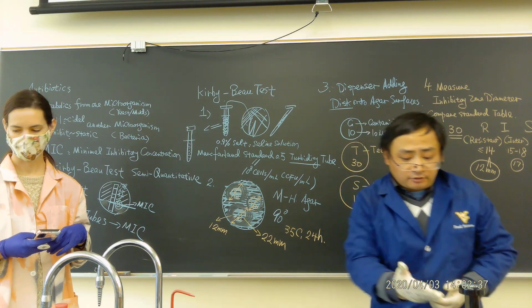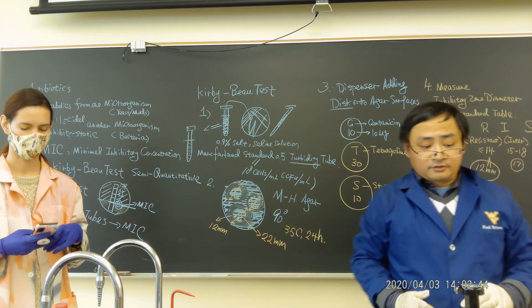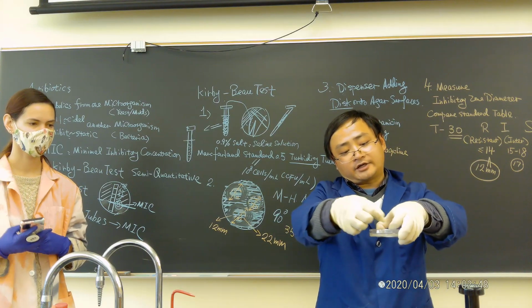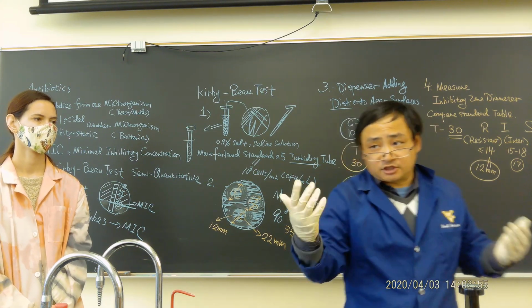Okay, I don't have too many left. You're the first lab. If some of you want to practice, you practice. But don't forget to label. Now, originally we should use forceps to press a little bit, but I skipped that because I don't have the forceps. I have to get them from the other lab, so we just skipped it.